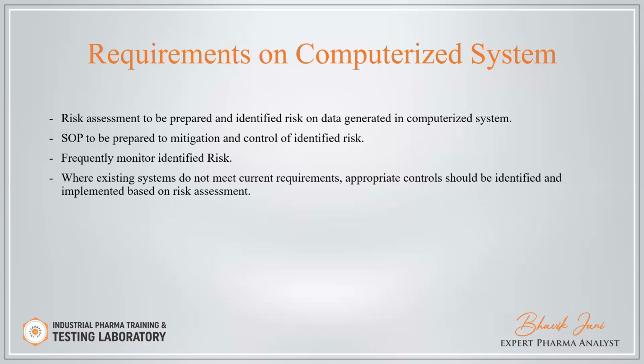Whatever access there is which changes your data or creates some alteration of the data, for that a risk assessment is to be prepared and mitigated. An SOP is to be prepared to control the identified risk. The identified risk should be monitored frequently. You have to define one frequency at which you review the risk.